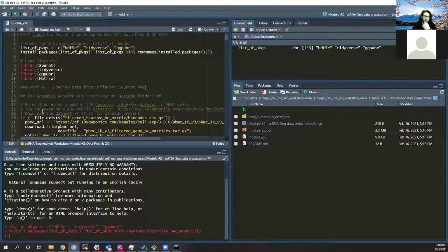All right, so question 3 is, will you also explain how to process raw SRA files that we can download from Geo to get the count matrices and doing the alignment? I'm actually just about to describe exactly how you do that. So yeah, these are all great questions, and hopefully I will get to each of them today.